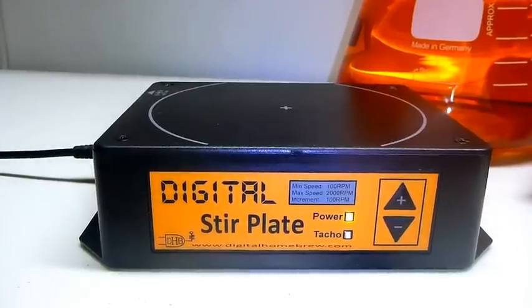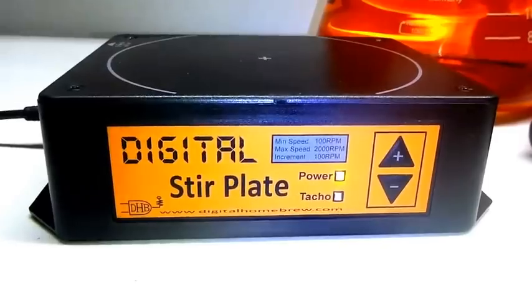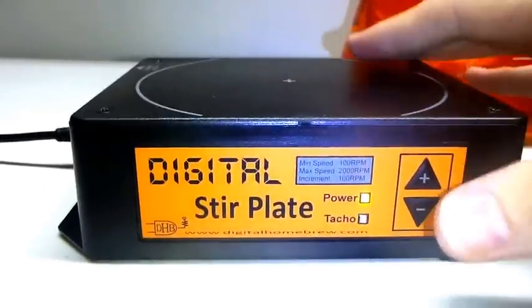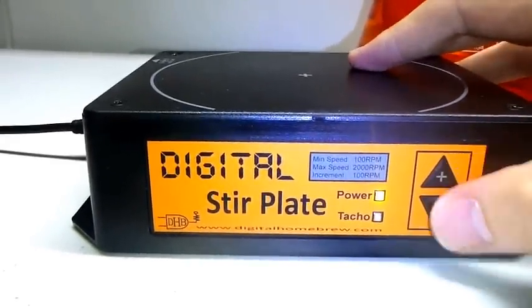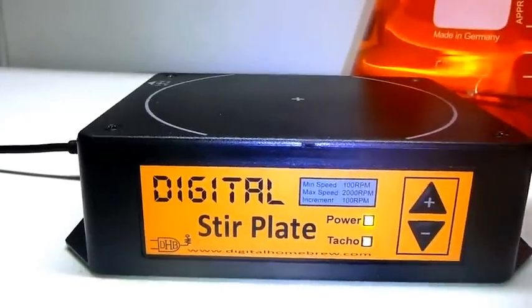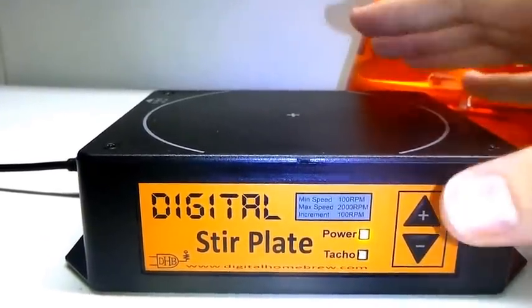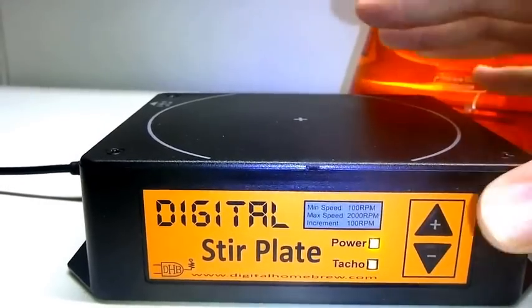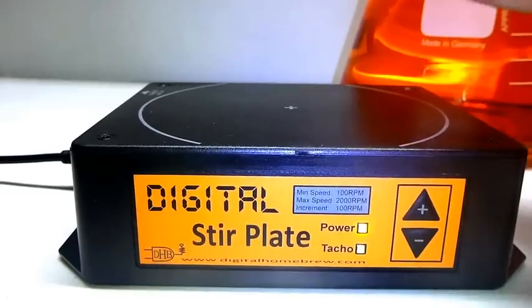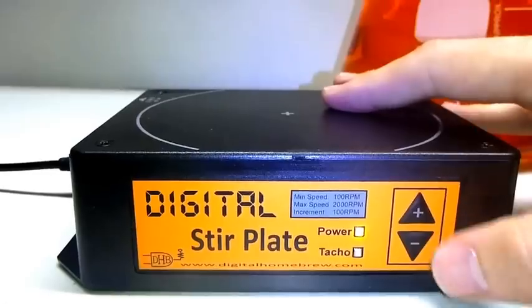For those who are already familiar with our digital stir plates, the first thing you'll have noticed is we've changed our front panel design a little bit. Most of it is superficial, but we have actually put metal domes behind the up and down buttons. So as you click them you get more of a tactile feel — if you're in a loud environment where you can't hear the beeps, you'll still be able to feel a lot better how many times you've effectively pressed the button. You won't get as much of that 'did that click register?' feeling with the new metal domes.